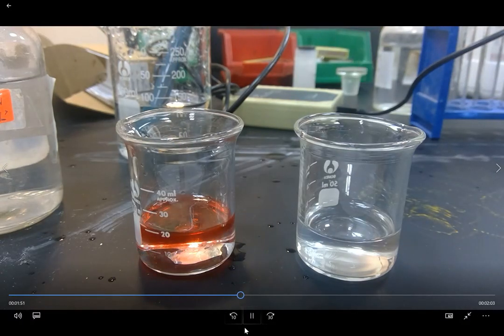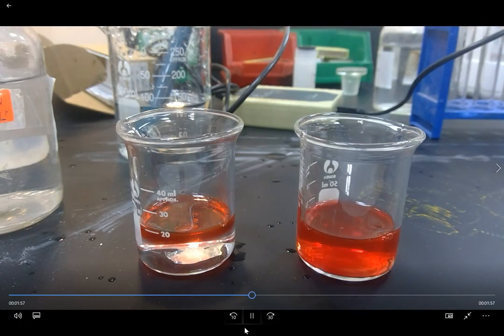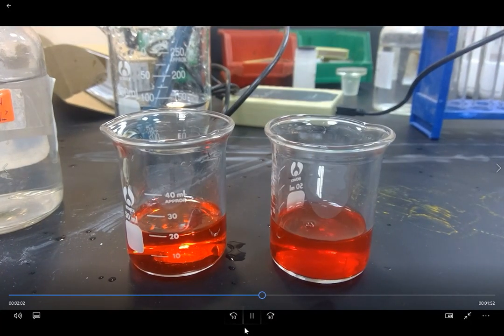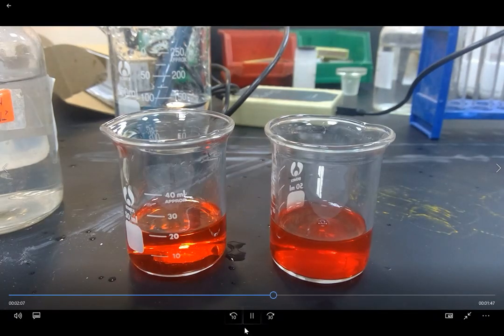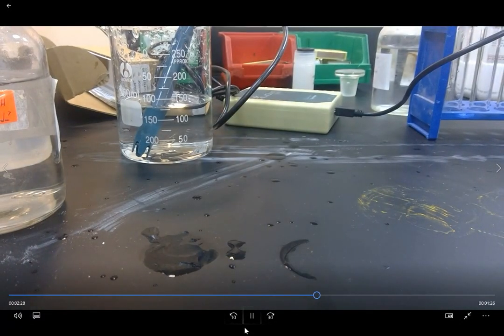And I should again find that there is a difference in the acids. Okay, so they are both turning red, because they're both acidic. We should be able to see, however, that the red on the left is a slightly more orange red, showing that it's a weaker acid, whereas on the right, it's a stronger red, which shows that it's a stronger acid. We can also look at the reactions of these acids with other substances.